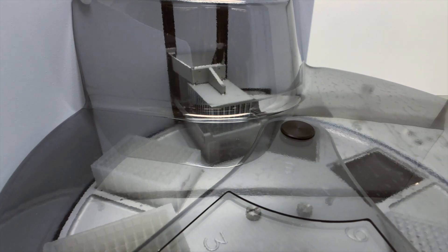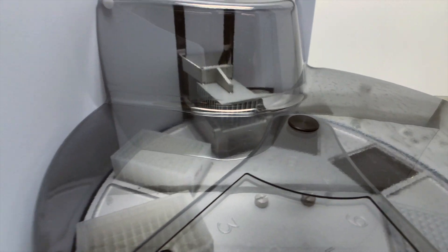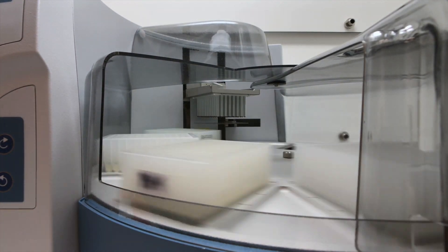We use robots if you have to extract hundreds of samples. This way it's just faster.